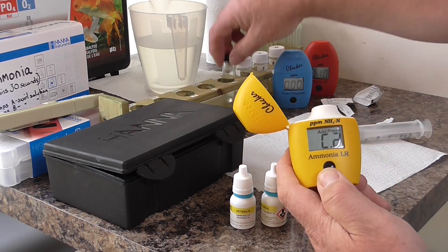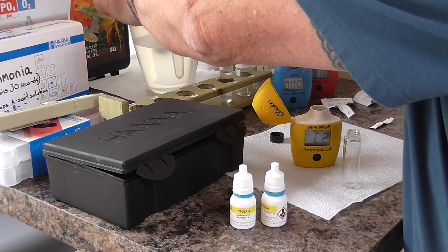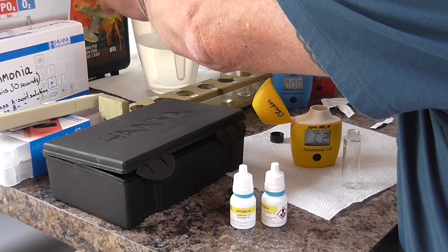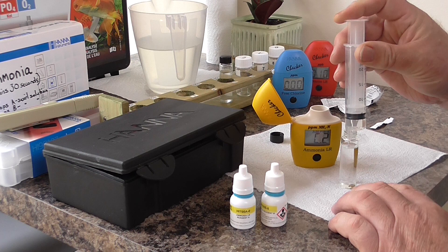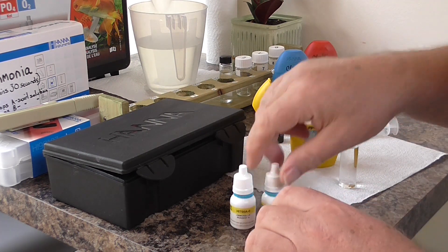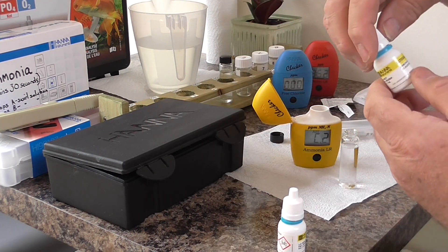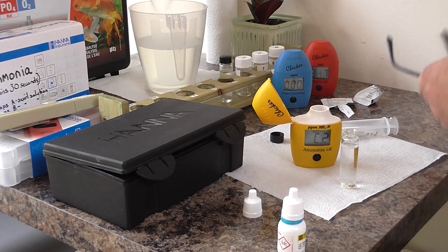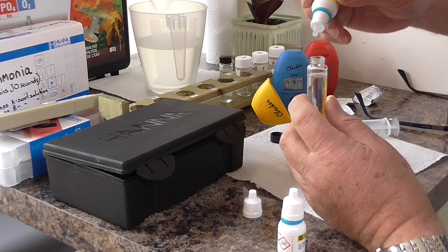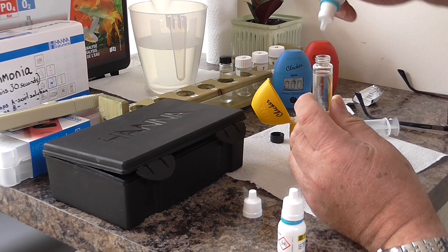Now we can remove the pond water. Get 10 millilitres in here. First we'll add reagent A, and we want four drops: one, two, three, four drops of reagent A.